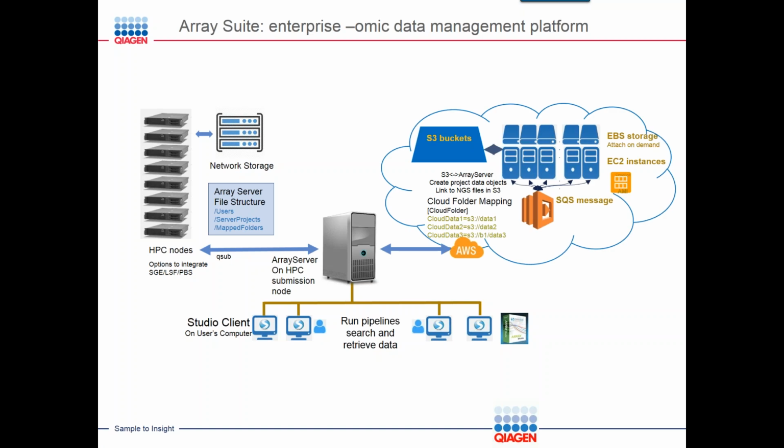I think most of our customers also have high-performance computing connected to the server, so that the server doesn't need to do all the processing job. We also extended this framework to cloud. I think some of our customers even have both. It is possible that you only have server or you only have cloud, but in our framework, it is possible to have both. And we actually recommend this type of mixed approach because sometimes it's convenient to have the local HPC. Sometimes it's useful to have the remote cloud.